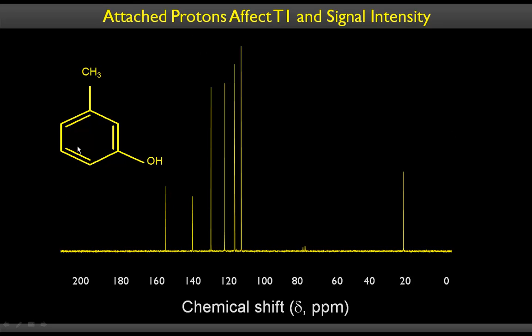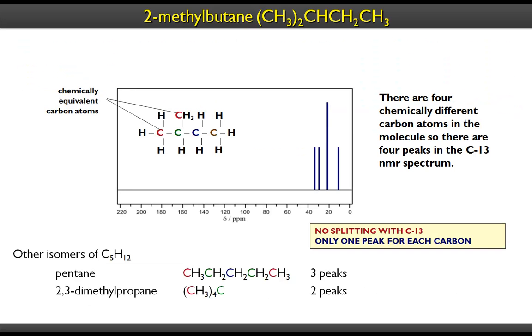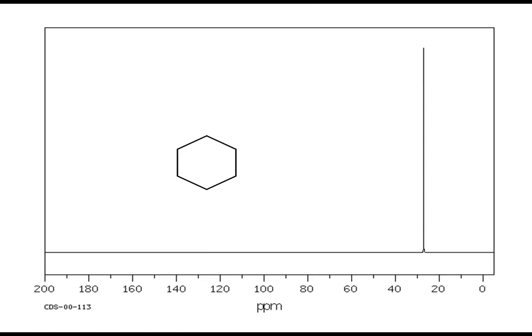In this case we don't need it because this is a methyl. We know that methyls come at a different place. These are aromatic carbons, they come at a different place, and we also know that the ipso carbons are shorter, so we know that these are ipso carbons, that are quaternary carbons. However, in some cases we do need that information, right? So we can obtain that information by edited NMRs. I'm going to skip some of these slides and then we'll come back to the discussions that we had. These are just examples, so I'm going to skip them.